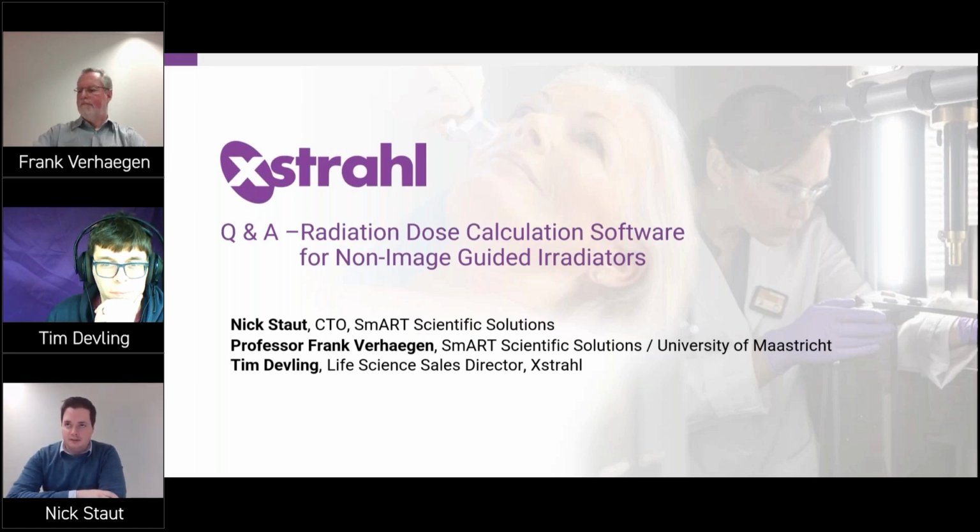For example, you could get histograms based on dose rates, thresholds, and things like that. But they're not in there at this time. It's not intended yet for Flash. But interesting. That would be whether or not there's a dose rate effect. Probably not, but an interesting question.